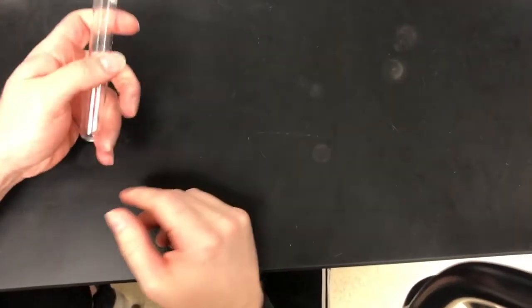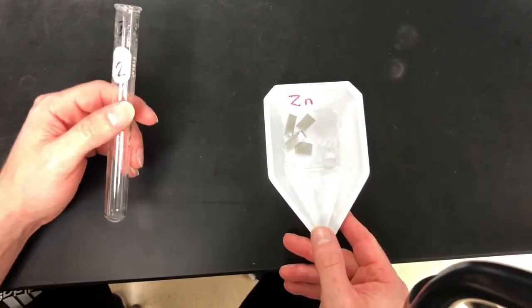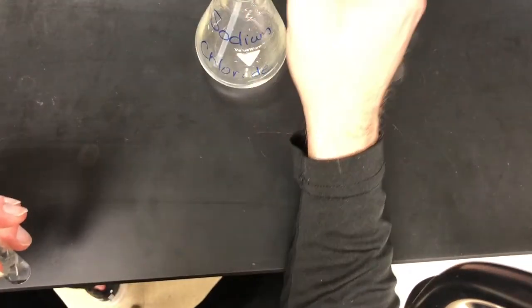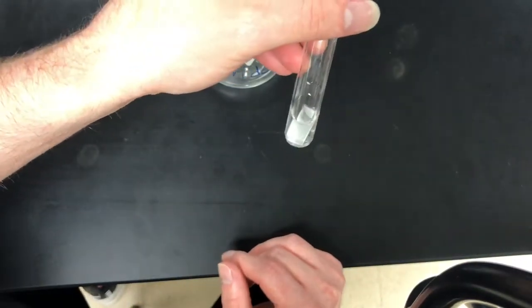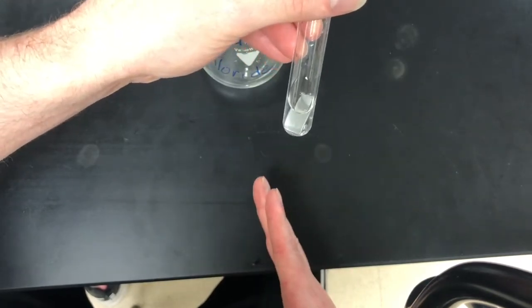So we're going to predict and see what actually happens when we take zinc and sodium chloride. So zinc, it looks like that. I'm going to take a piece of zinc and put it in my test tube. And then I'm going to take a squirt of sodium chloride. Let's make sure all of the zinc gets covered. We don't need an exact amount. You can tell nothing happens in this reaction. So our prediction of no reaction was actually true.